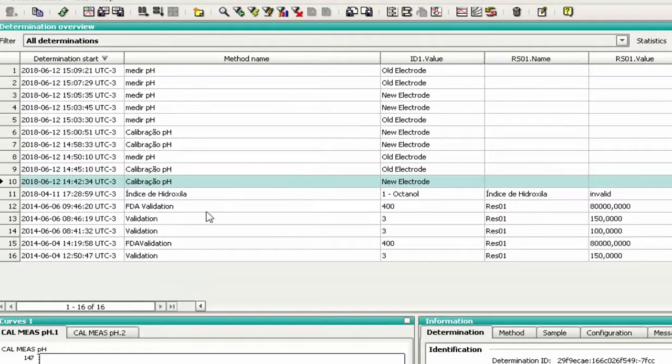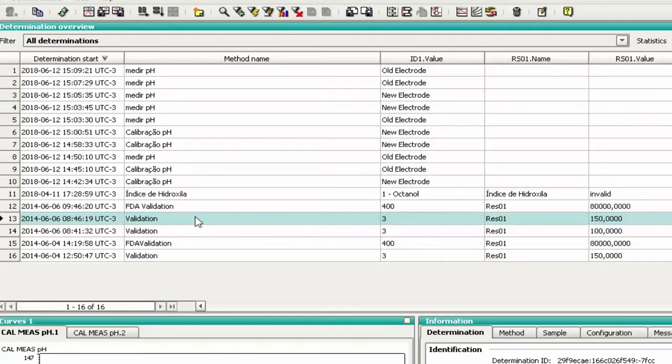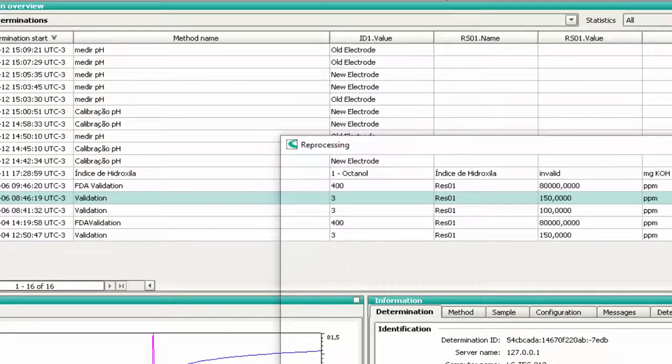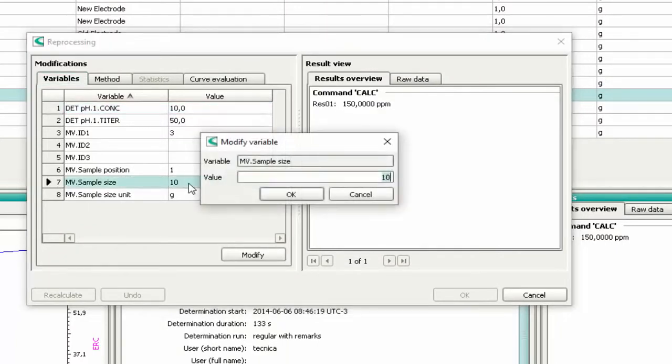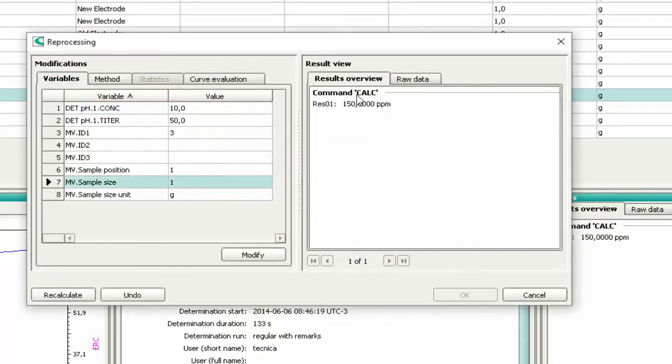Now we will correct a mass error. Double-click on the line of the sample size. Change the value of the mass and press OK.